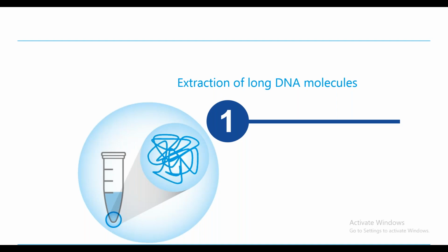First, you need to extract megabase-sized DNA molecules, and standard DNA preps don't allow you to do that. There's just too many mechanical forces on the DNA, and it rips these molecules apart.